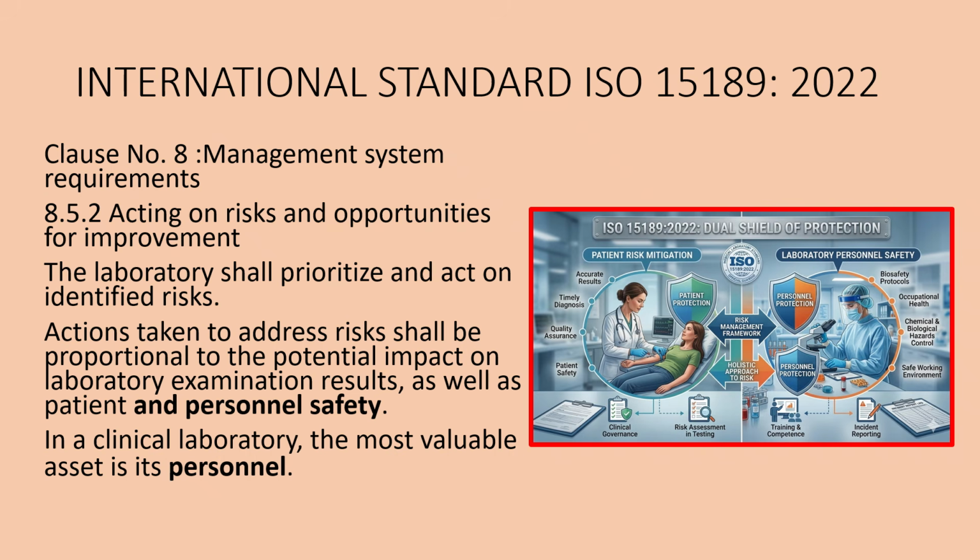On the left axis, we have patient risk mitigation, processes which are involved in the laboratory workflow. On the right, we have laboratory personnel safety. The arrows indicate that these two are linked and that they interact with each other.